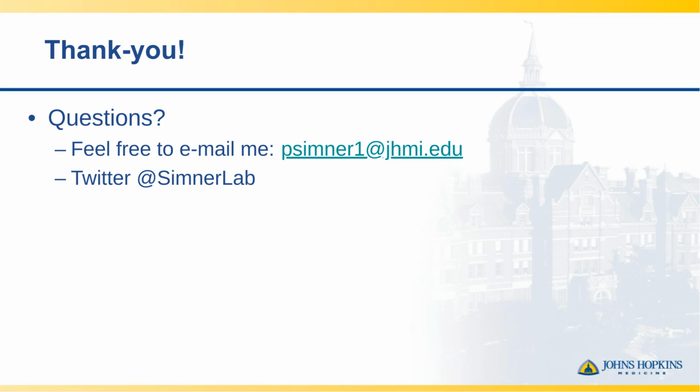Thank you. Next question. Was a cost analysis of WGS per colony compared with other methods performed? We didn't do a cost analysis currently in our studies. However, I'm optimistic that these costs are coming down. If we think about Nanopore and the Flongle, it's $90 for that flow cell, and we can start to get the reagents for whole genome sequencing down to a cost comparable to some of the multiplex molecular panels that we apply.